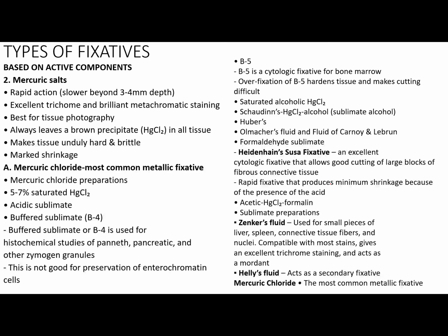The next one would be your mercuric salt. Ang mercuric salt class, they have very rapid action. Slower beyond 3 to 4 millimeter per depth. Di ba nga si formalin, 1 millimeter per hour ang nape-penetrate niya. Si mercuric salt nyo naman, rapid at least 3 to 4 millimeter depth per hour. Now, these are excellent trichrome and brilliant metachromatic staining. So, maganda siya for trichrome staining, metachromatic staining, pag gumamit ka ng mercuric salt na fixative.